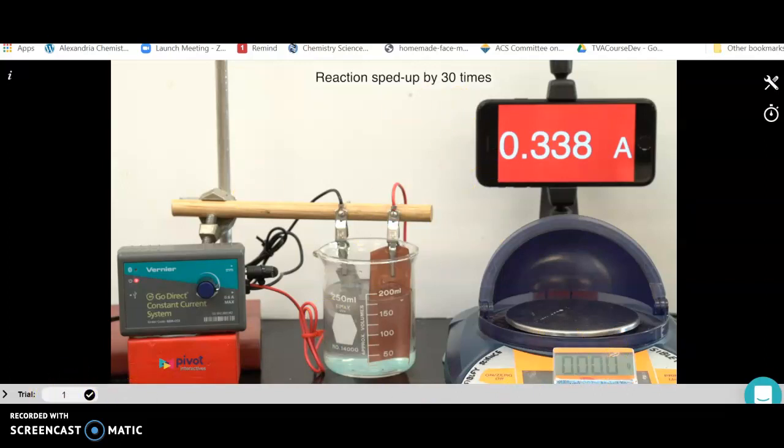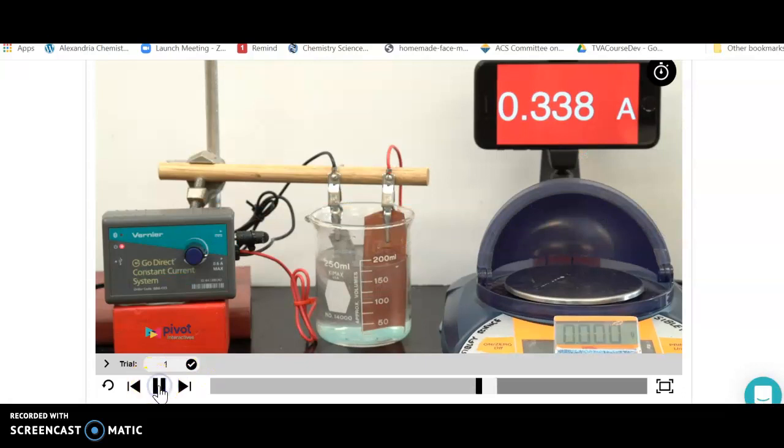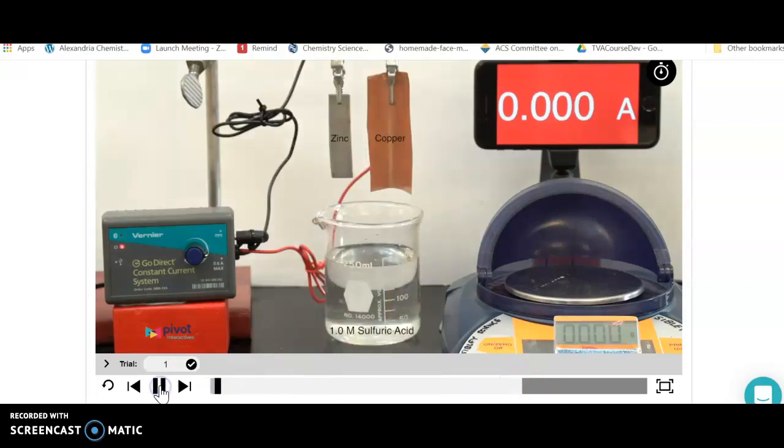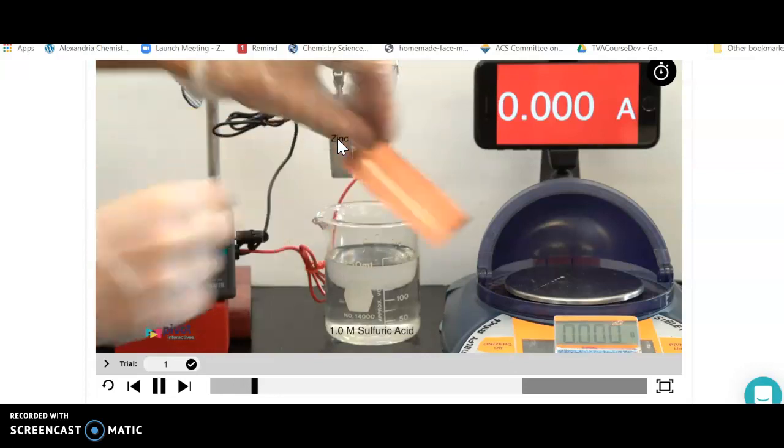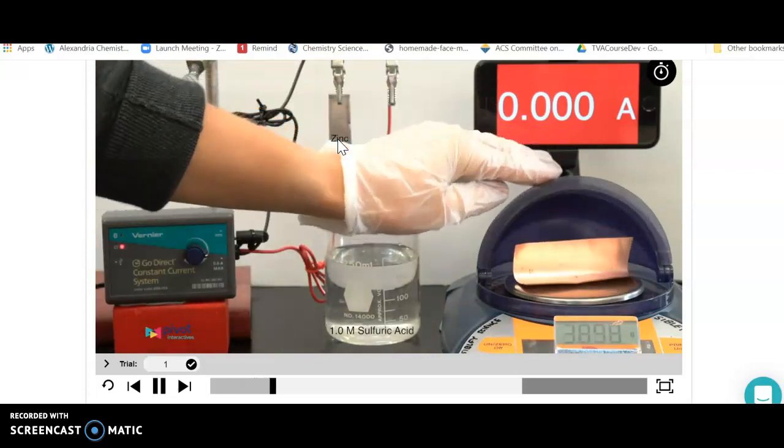When you start with trial one, you're going to go over here and hit play. As you hit play, what's going to happen is you're going to see copper and zinc up here.